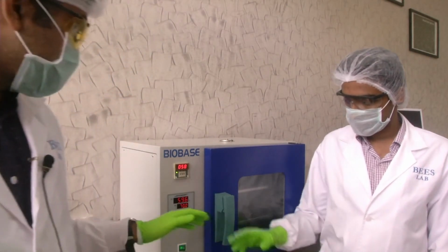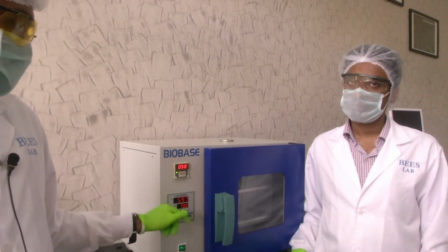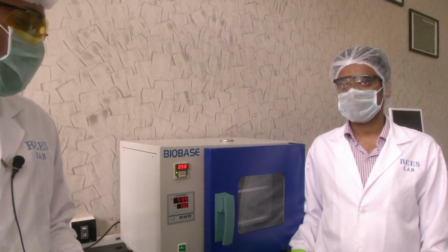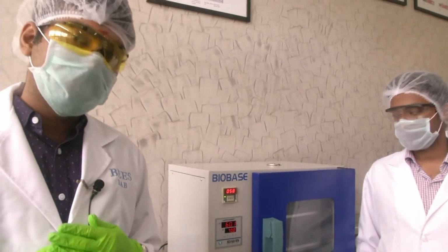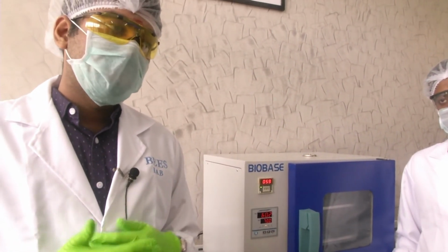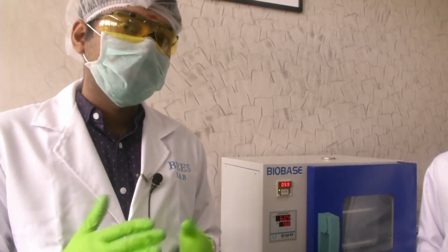Now, if you can see, the control system is slowly ramping it up. It has reached 59.7, it will slowly become 60 and it will ramp to 70 degrees Celsius. These are the main things that you should worry about while using an oven, and we have seen the different applications for an oven, how an oven at many instances is better than a hot plate, and why it is a very important and necessary equipment in a laboratory setup.